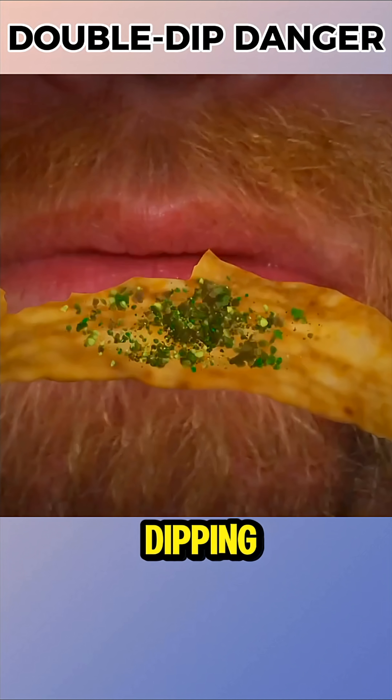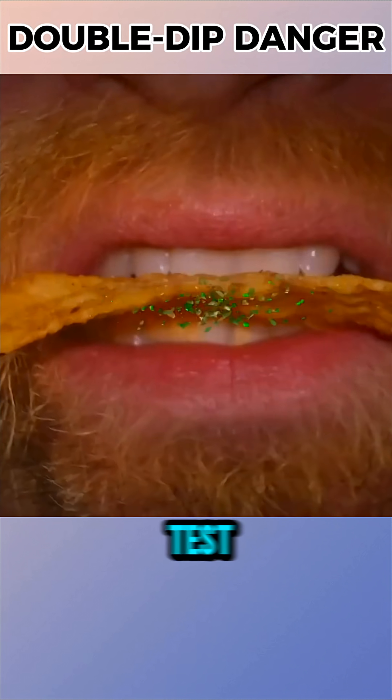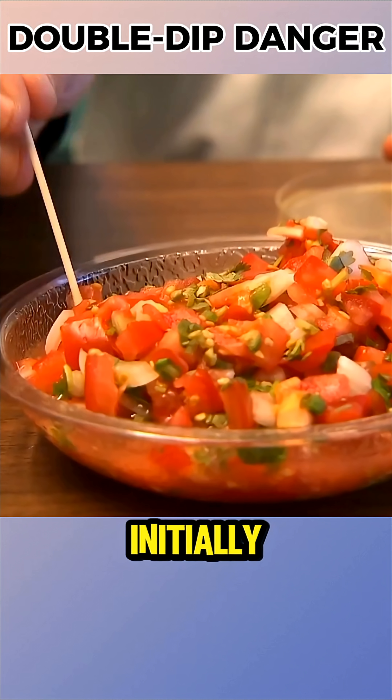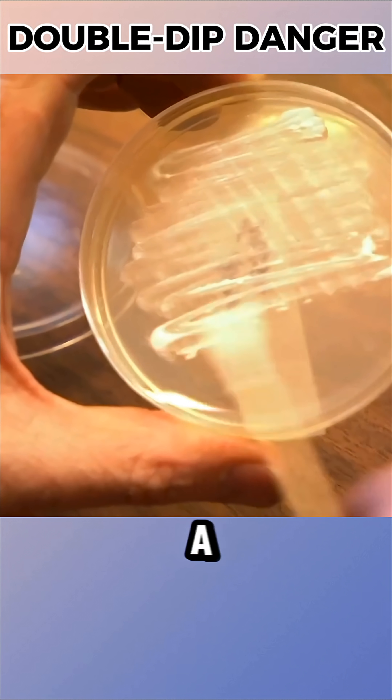There's a common belief that double dipping can transfer bacteria into a shared dip and spread it to others. To test this, the MythBusters team prepared two types of dip — creamy and salsa — and a large bowl of chips. Initially, they sampled each dip and spread it onto Petri dishes to create a control group.